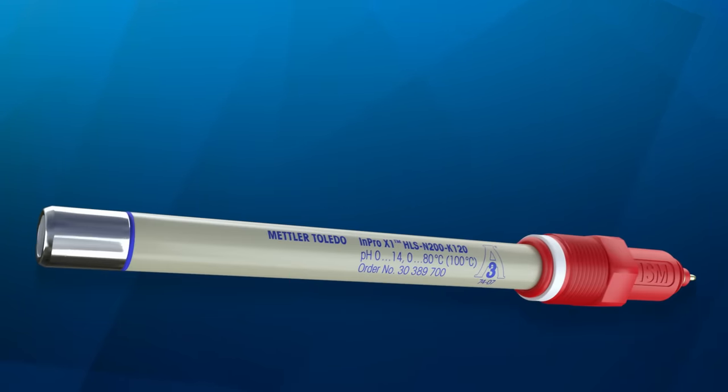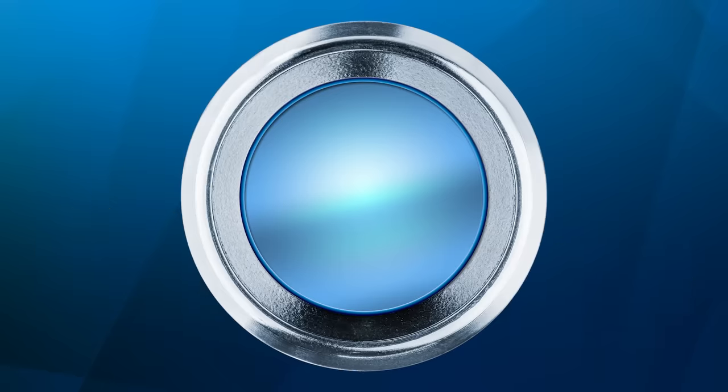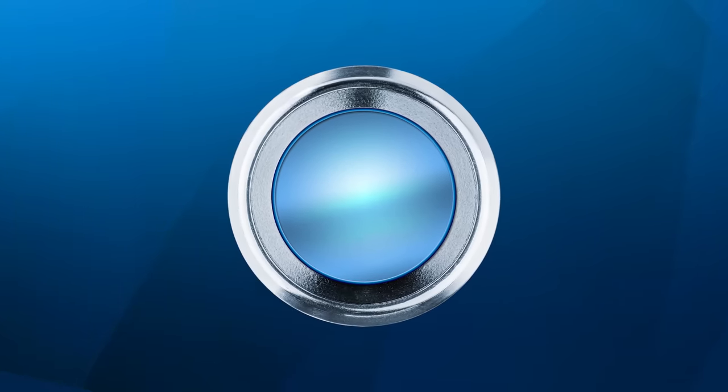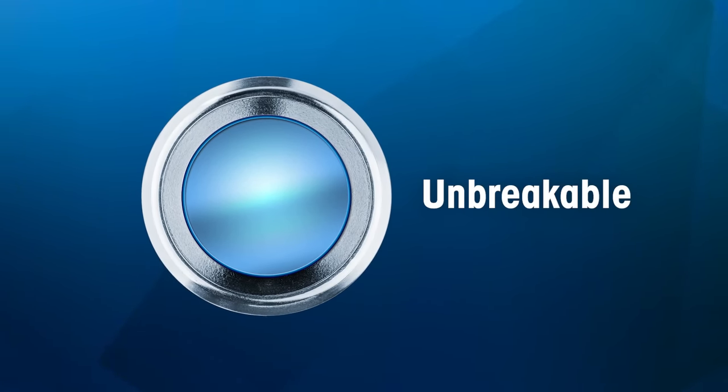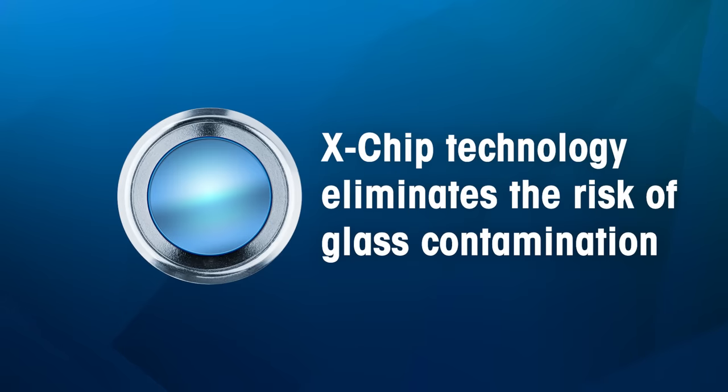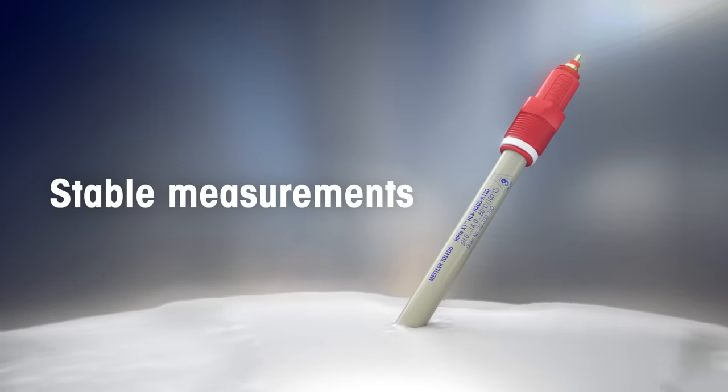InPro X1 HLS features unique x-chip pH sensing technology. The x-chip won't shatter, so there's no risk of glass getting into your products. Thanks to the x-chip, measurements are extremely stable even after more than 100 clean-in-place cycles.